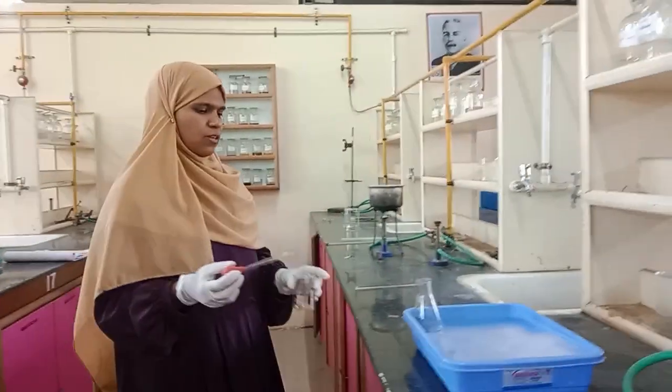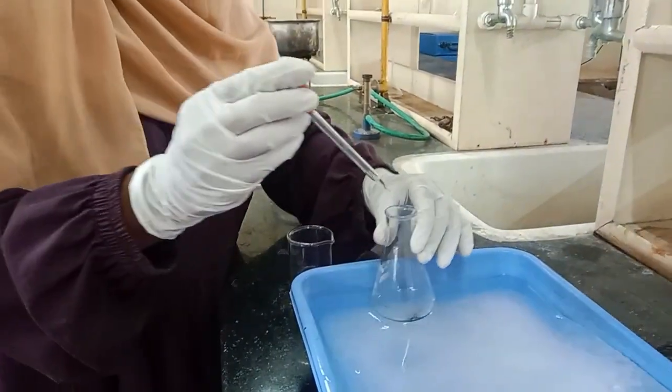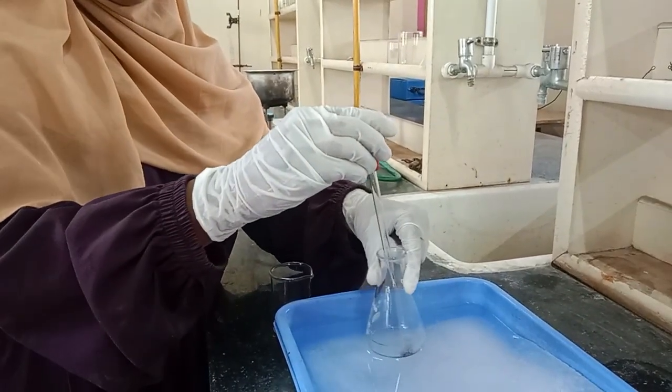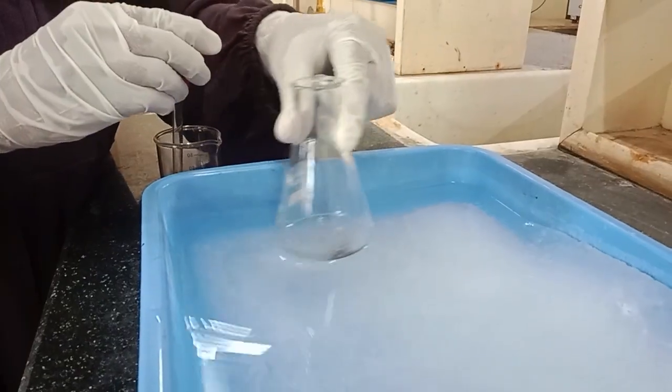This acetophenone, you can add drop-wise to this nitrating mixture in the ice bath. You can add slowly and continue stirring.